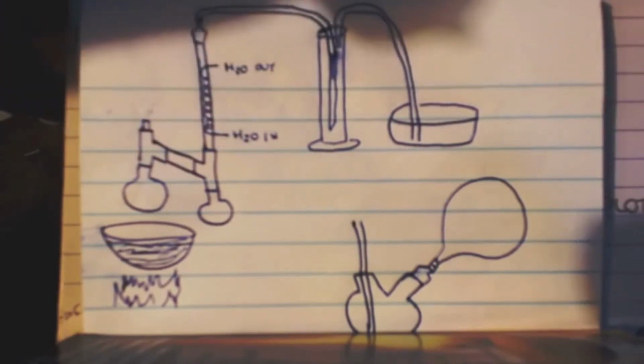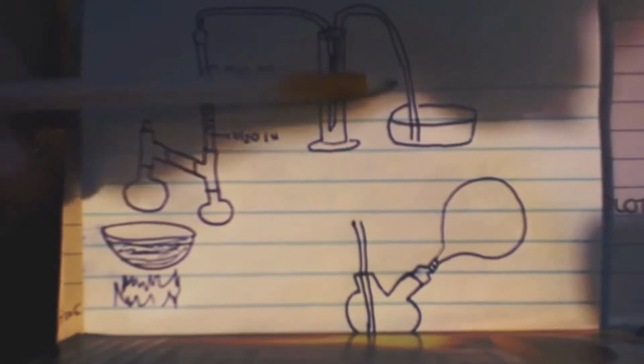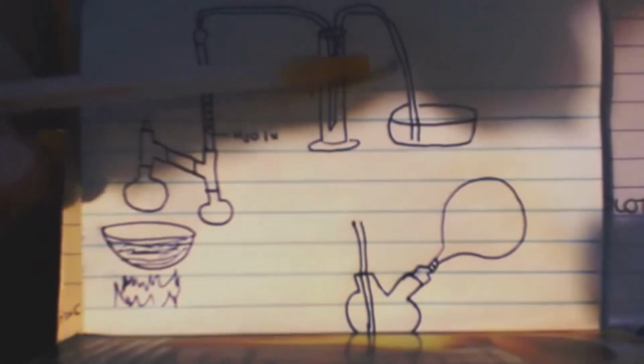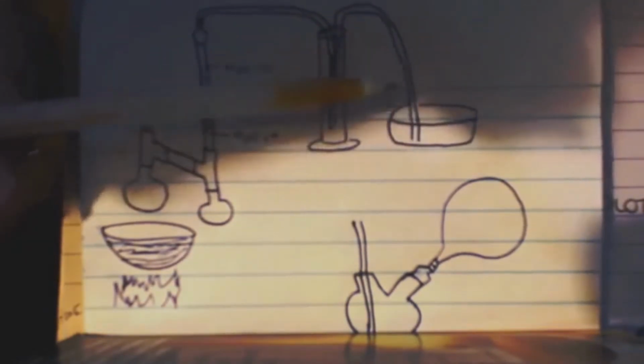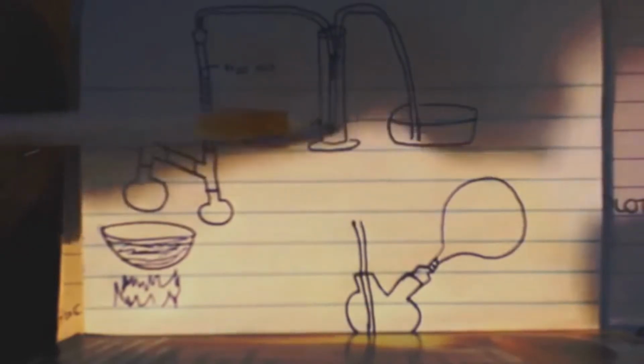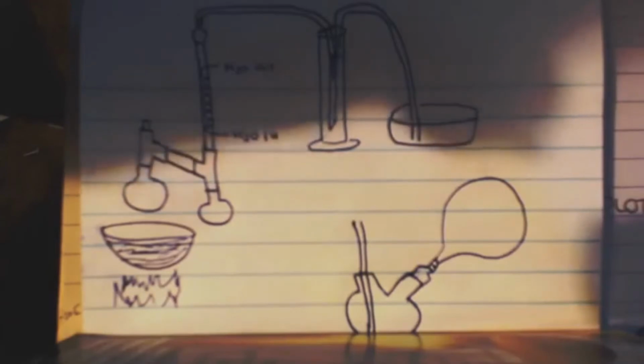Now, another way you can do this, and always have a bubbler. I mean, a suck back trap. You know what I mean? When this comes out, you want to have a suck back trap in case this gets sucked back. It won't get sucked back into here. I didn't draw it because it's an obvious thing. It should be on every type of distillation type thing like this.